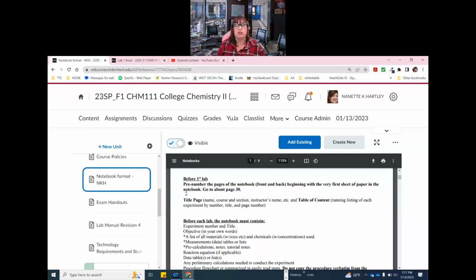Okay. I used to work in industry. My lab notebook was used by not just me, but also other people that I worked for. And they had to review it in court cases. So there are certain things that had to be done in certain ways.